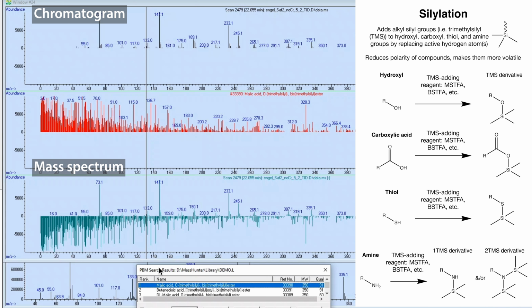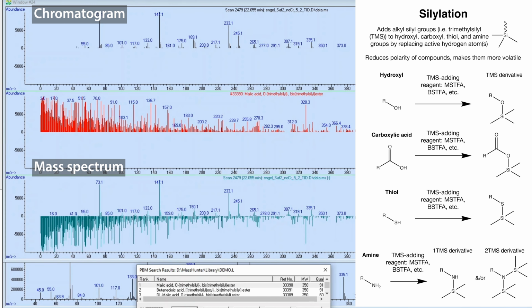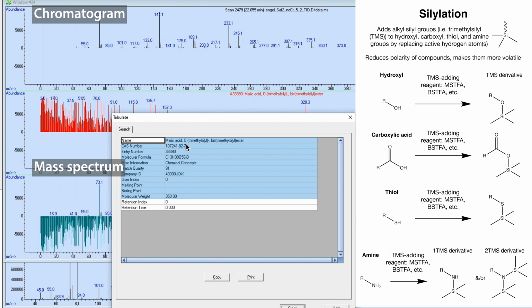And here it's also showing the differences. If I just do this, it doesn't show me that. But if I show the differences, now it's saying, okay, we've got this much stuff that we shouldn't have, and we have this much stuff that we should have. But if you look, these numbers are a lot smaller than the numbers that we actually got for our peaks. You can also go to the text, and you could get the information if you wanted the compound name.